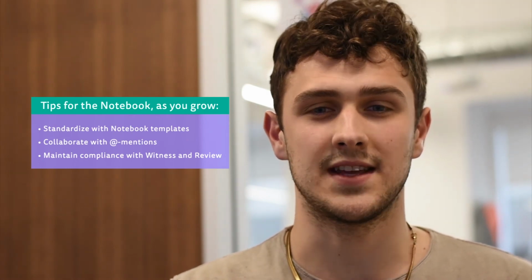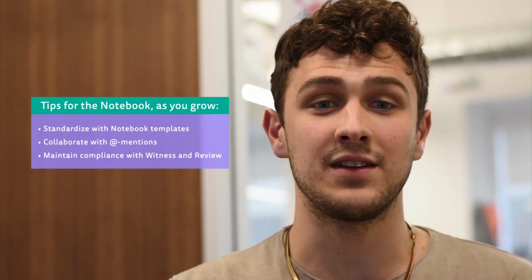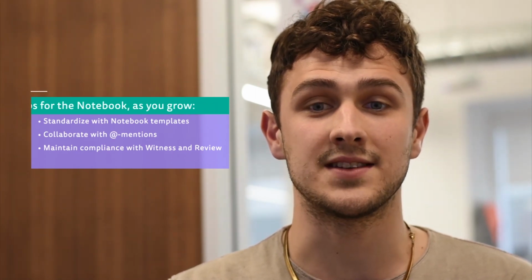We hope you use these tips to get the most out of the notebook, and you watch our molecular biology training videos to learn how sequence data is integrated with the notebook. Thank you for following along.